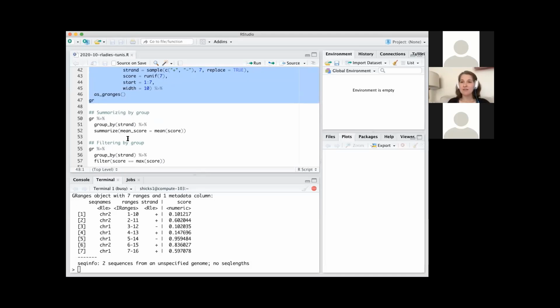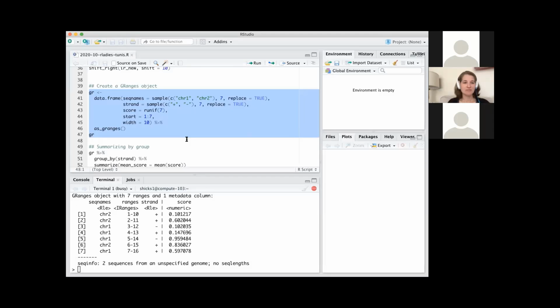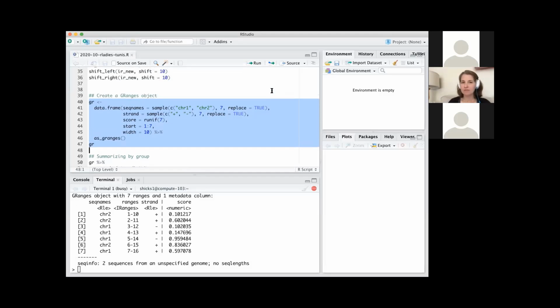Stephanie, we have a question actually. Yeah. Sorry, you probably already said this, but I missed it. Are the intervals left closed and right open? For example, are they using interbase coordinates like with the BED file, or one-based like with BLAST? Sorry, I meant interbase, not interpose. I'm gonna need to, okay, do you want, maybe I can find the question. I need to reread it, sorry. Okay. Maybe at the end we can, yeah. Okay, that would be great. Yeah. Sorry, I want to make sure I understood the question.